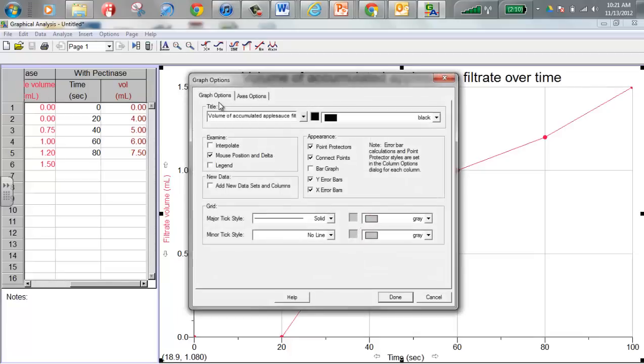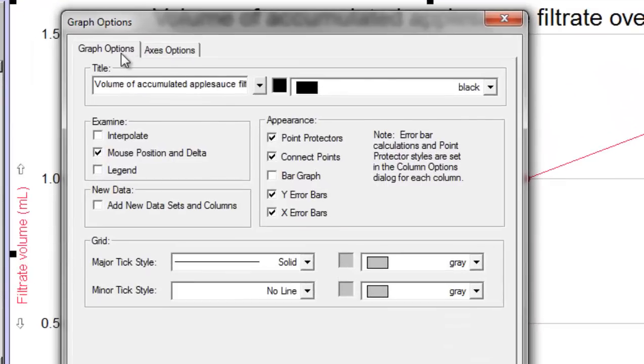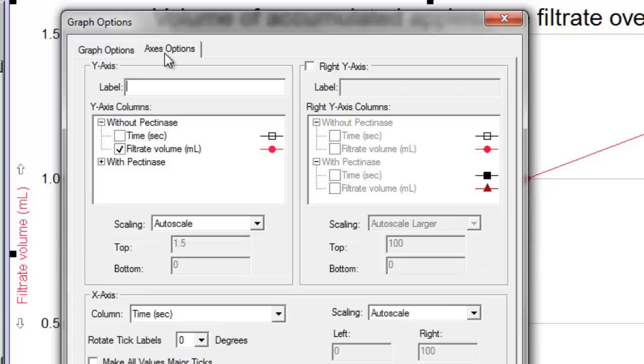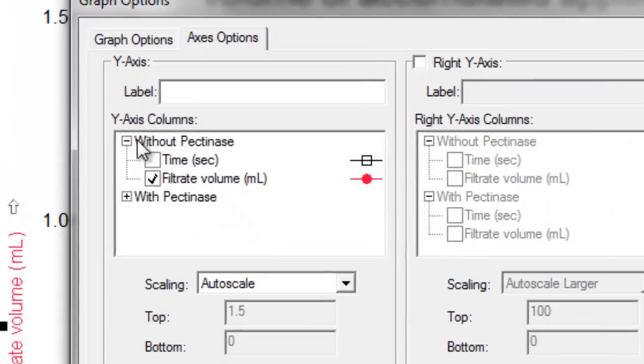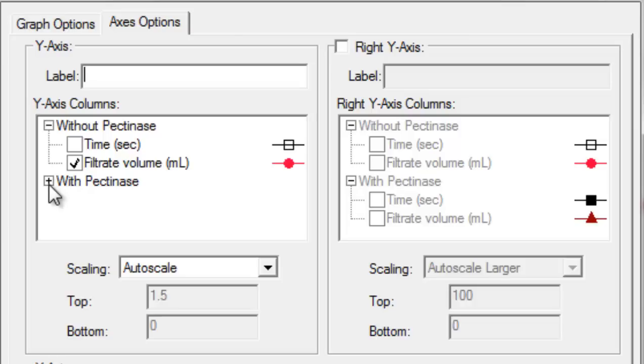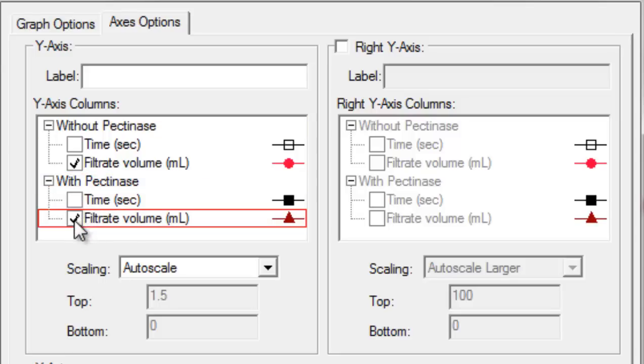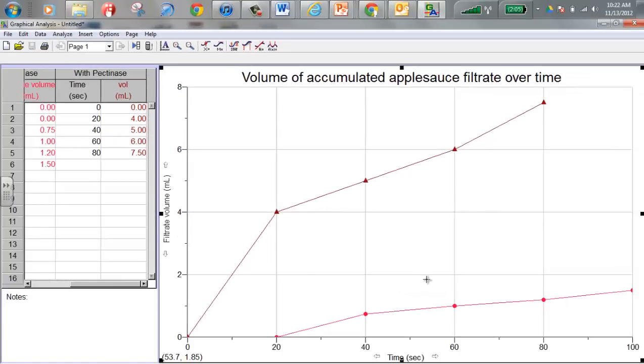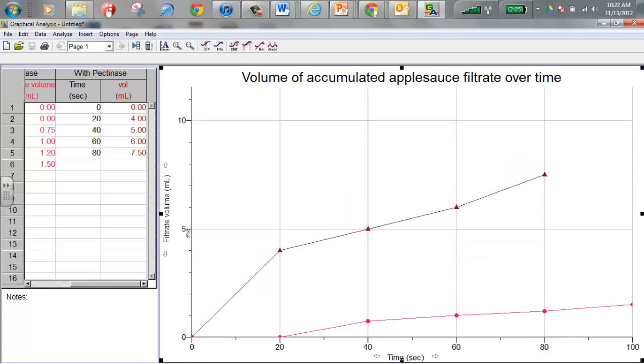To do that, you need to go to either Options or you can double click on the graph to get the Graph Options window. Then you see how there's two tabs within the options window - you've got the Graph Options window and you have the Axis Options window. Axes (A-X-E-S) is the plural of the word axis. You've got options for both axes here. In this y-column, this y-axis column window, we've got without pectinase, which is the name of the first data set that I did over here, and then there's another with pectinase. To open this up and tell the computer I want that graph too, I got to change this plus to a minus. So I open it up and then just select the y data - the volume data is the case here. Do you notice that we're going to have two separate symbols? There's a circle and there's a triangle, and that'll help us differentiate the two lines. Once you hit Done, there it is - now the two lines are there.